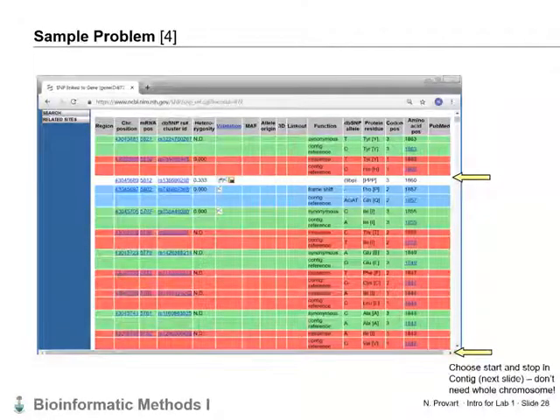This part in red down here: all the non-synonymous changes are flagged in red in terms of the SNPs, and then we could design primers in that specific region, so we could sequence DNA from an individual to see if those polymorphisms are present, typical polymorphisms across samples in the database.